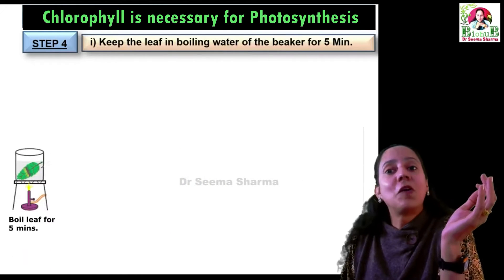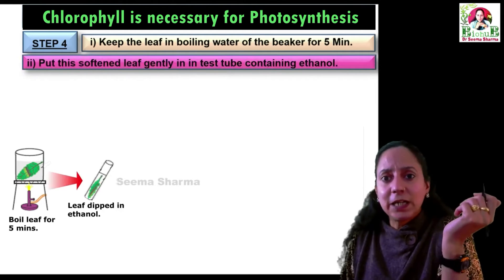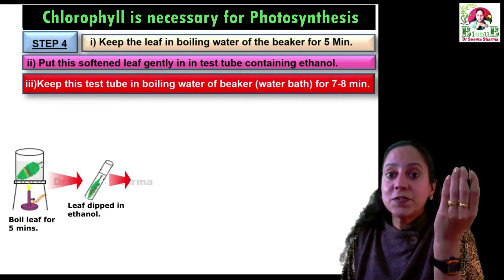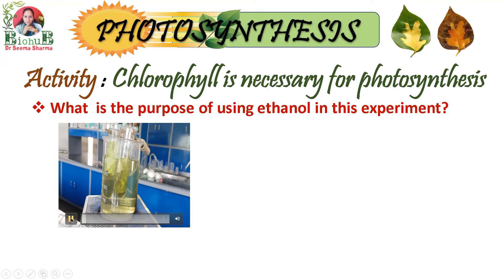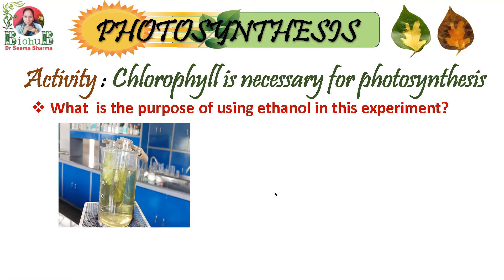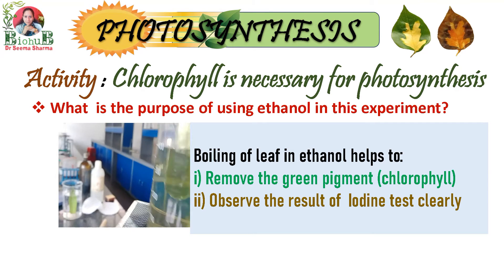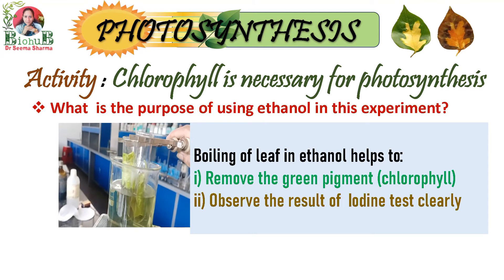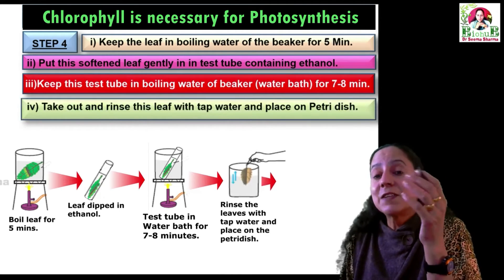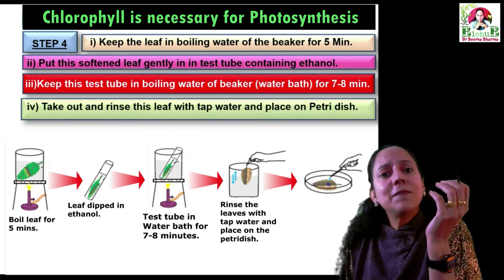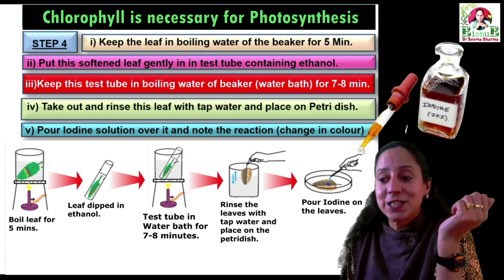Then subject this variegated leaf to the iodine test: first, keep the leaf in boiling water for five minutes. Then put the leaf in a test tube containing ethanol and heat the test tube on a water bath for seven to eight minutes. Boiling the leaf in ethanol serves two functions: it removes the chlorophyll pigment from the leaf, and it allows the result of the iodine test to be observed clearly. Take out the leaf, rinse it gently with water, and spread it carefully on a petri dish.